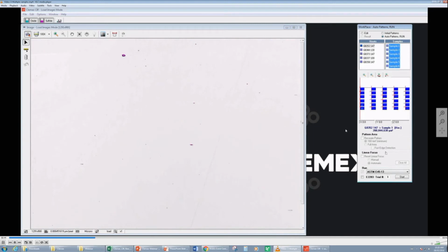So once we're ready, we're going to notice here that it's set at 200 square millimeter, but here it's 160 because the standard is not chosen. We're going to be choosing here ISO standards, which is 200 square millimeter.